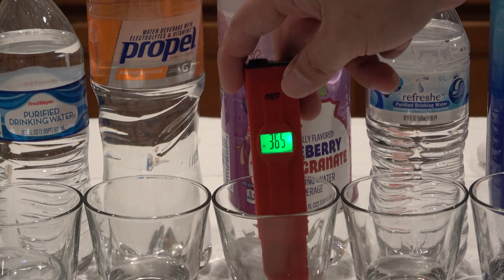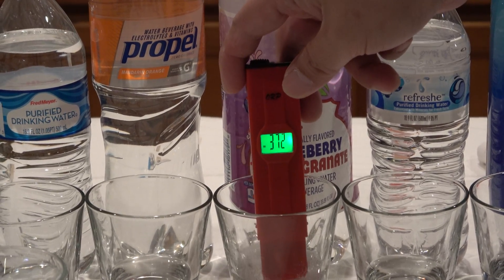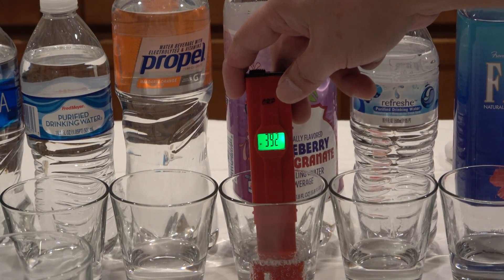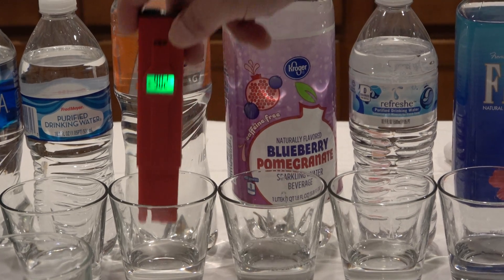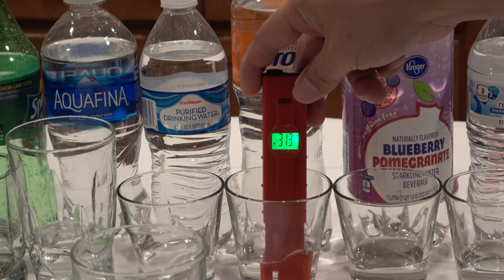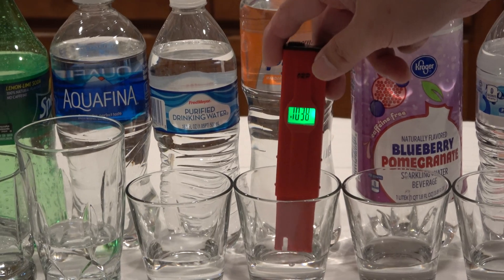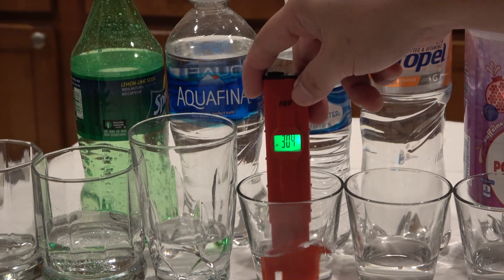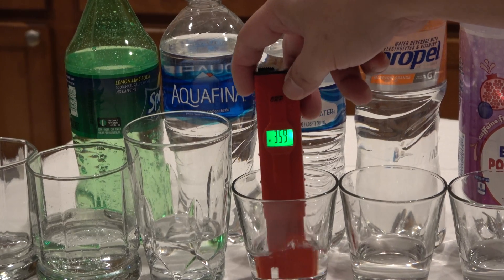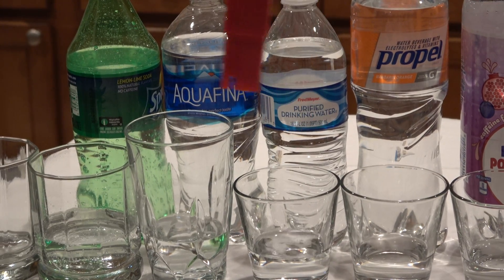The blueberry sparkling water from Kroger is about 366, 365 — positive 370, 390. The Propel Gatorade is about 312. The Fred Meyer purified drinking water is about positive 312 and climbing.